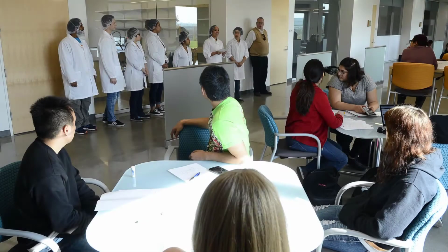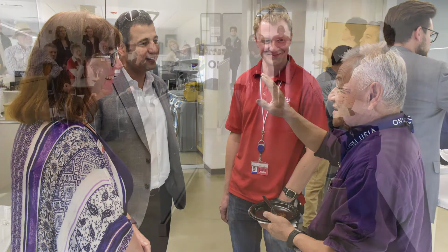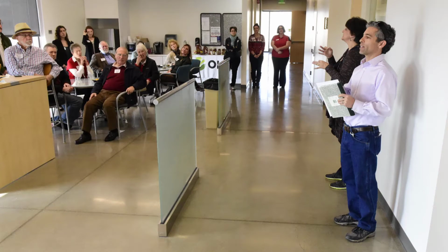The waiting area should be separate from the booths. This area is flexi-space and serves as a space for the participants to wait or to receive any instructions. This is not a mandatory area, but it is desirable.